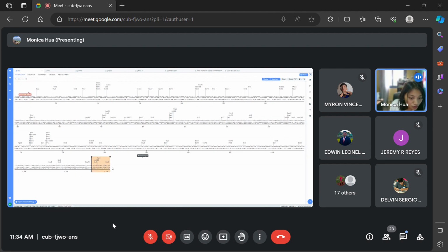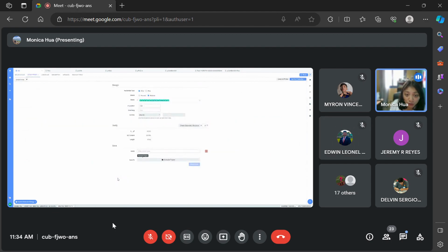Around 20 also, same parameters. Remember to click reverse, so the program can reverse it for you. 57 is fine. 33, let me see if I could save it.